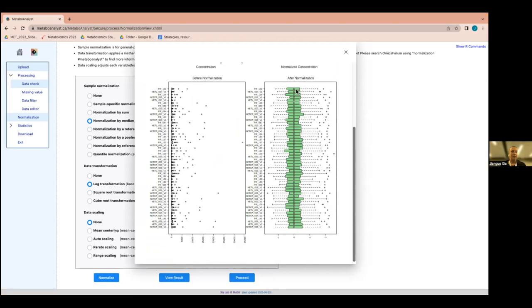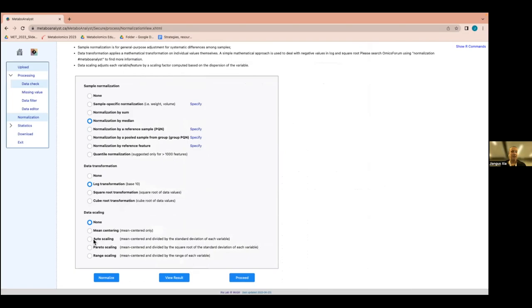With the sample view, we want to see all distributions roughly comparable across the dataset. I haven't auto-scaled here, but you can. If you want to do PCA analysis, it's usually a good idea to auto-scale. If you want to preserve your actual concentration values from your targeted assay, auto-scaling loses that information. So it's really a preference — neither is wrong, it just depends what you're doing and what you want to use the results for. Then normalize and proceed.